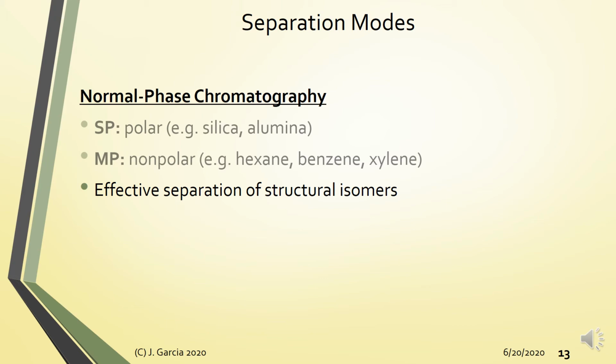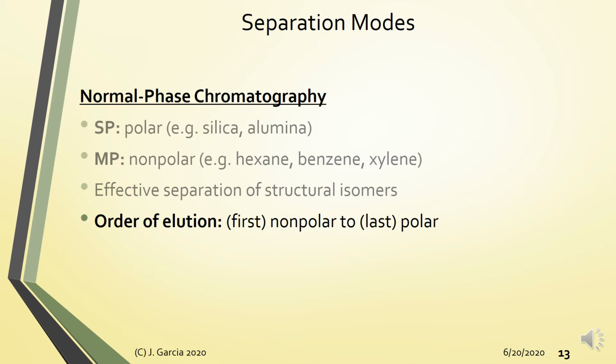So basically here, this is based on adsorption, yung stationary phase mo is solid. So the order of elution, kabaligtaran lang nung sa reverse phase. Since the mobile phase is nonpolar, then nonpolar components will be eluted first, while the more polar constituents will be retained more or will have a larger retention time.